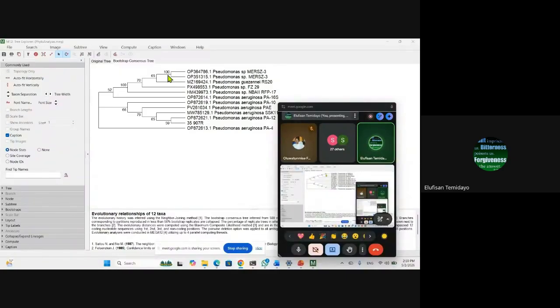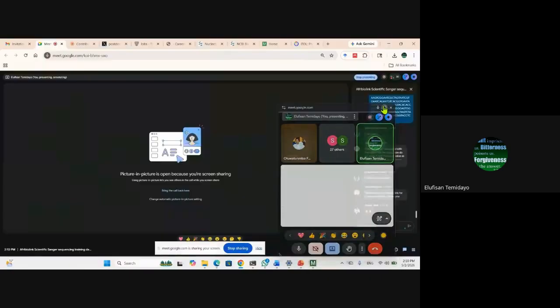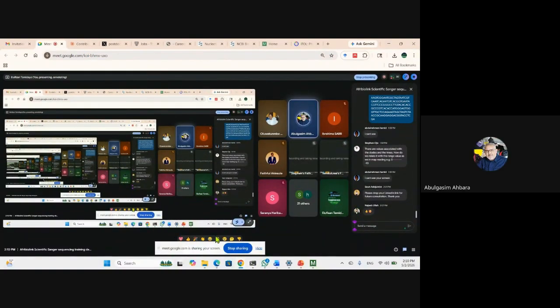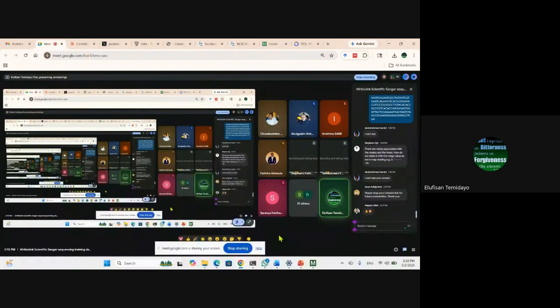Do you get it? We can't trust it because it means that every time I search, I could mix them up randomly only less than 50 times, but for 100 times I could mix. So that's what those numbers refer to. It tells you how reliable it is that they come together. Do you mean the number of simulations? Yes, okay, let me use that word for those who use simulations. It is the percentage reliability of your simulation. That's what it's saying.